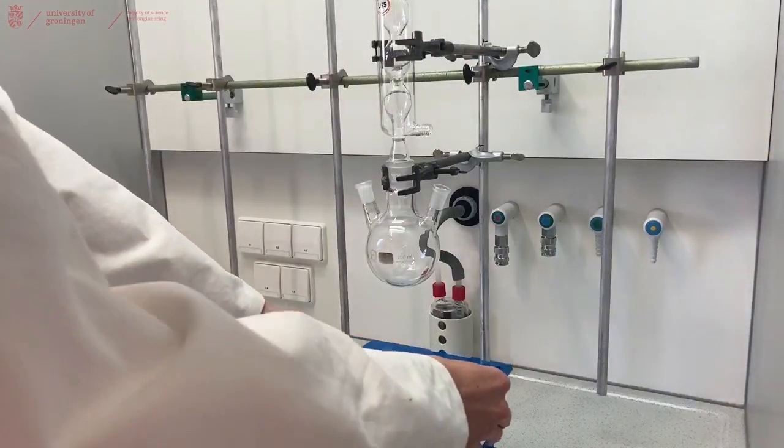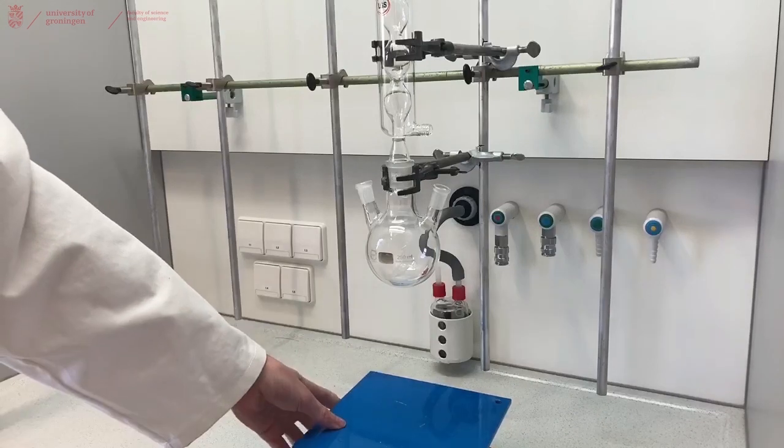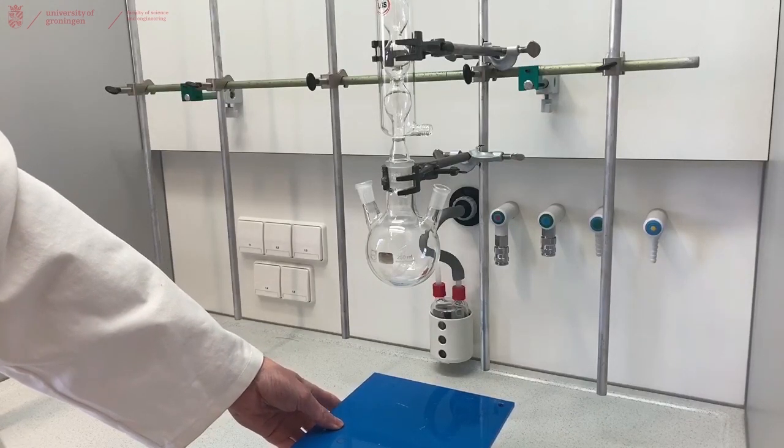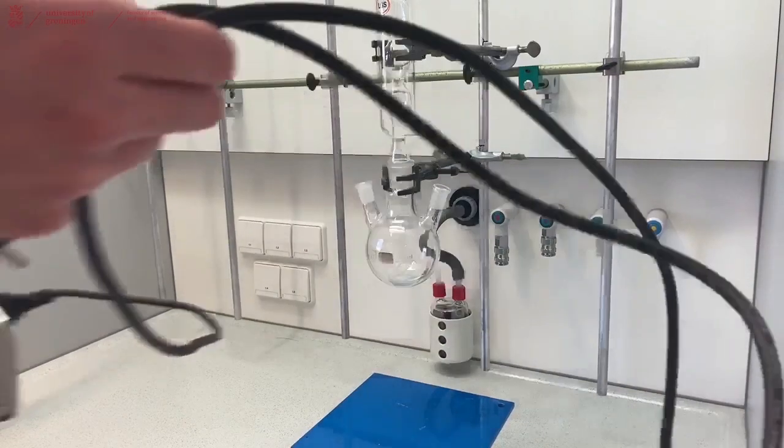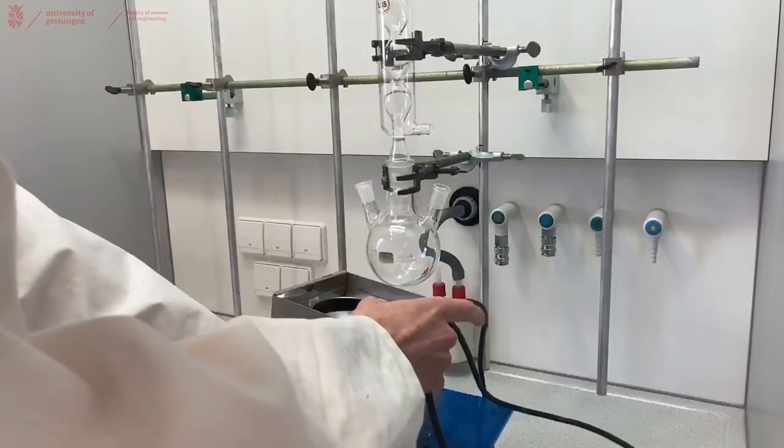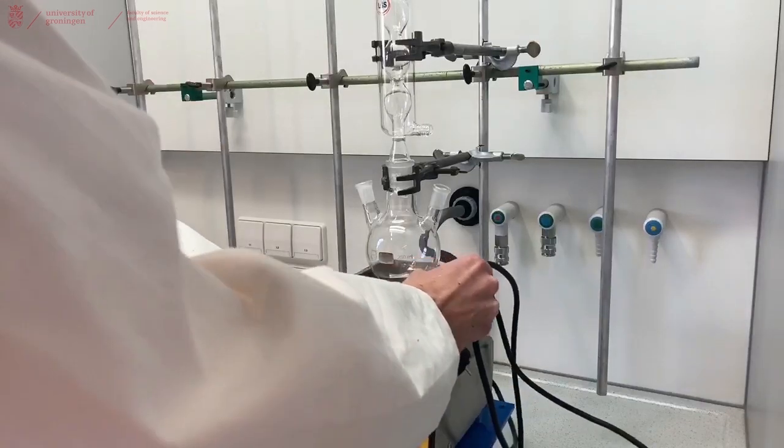Place your heater and lab jack underneath your three neck flask and be careful not to smash your flask.